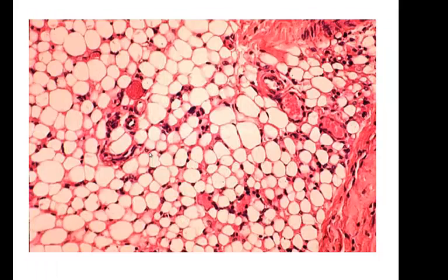This is adipose tissue. It's your next loose connective tissue. You would identify it as adipose tissue. You would classify it as connective tissue. You don't have to say it's loose connective tissue. You don't have to go that far. You just have to say it's connective tissue.